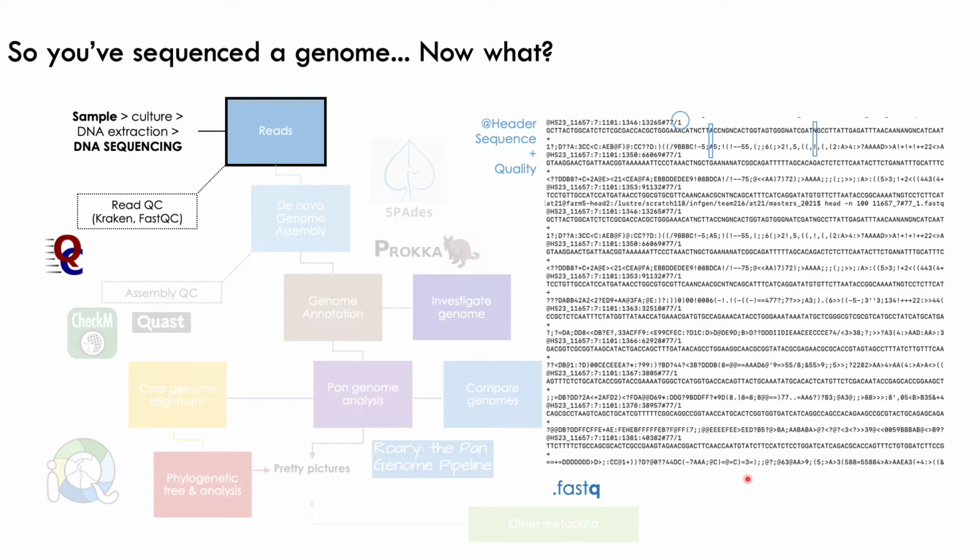And from then you can either choose to keep all your reads, keep some of the reads, filter or trim some of the reads depending on their quality. It's really up to you depending on what your quality is like to begin with.